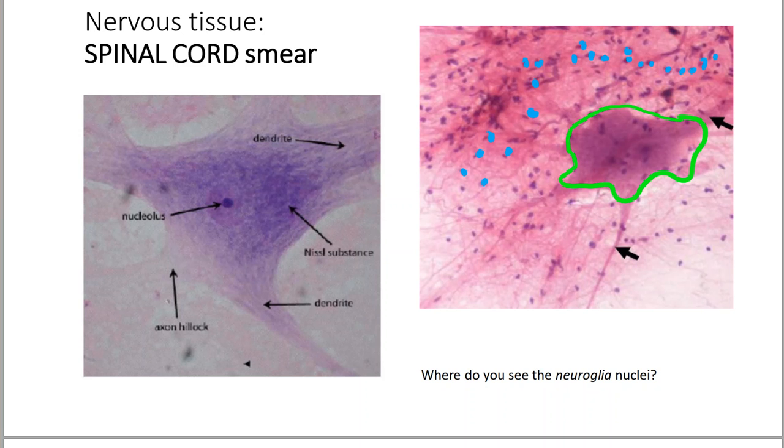And so I'm going to ask you to identify those. And then within that neuron cell body, we're going to identify a few pieces of architecture. And so there's going to be a nucleus, right? And then the arrow is pointing here at the bright nucleolus, which is inside of the nucleus. And then we have the cell body itself, which is this outlined thing in green.